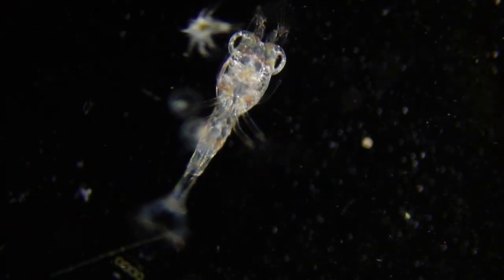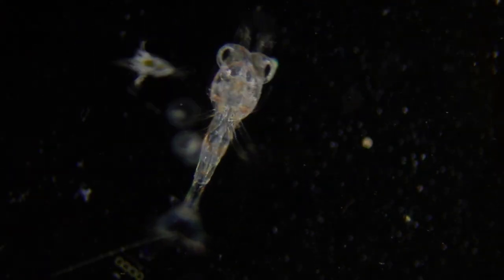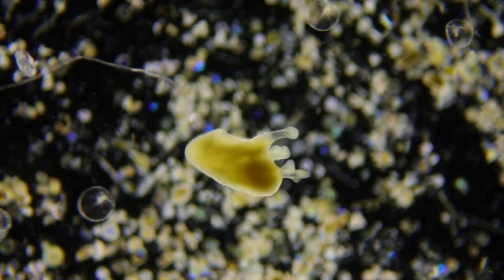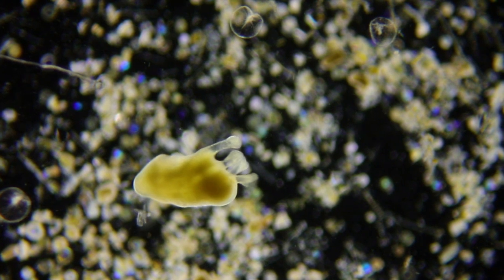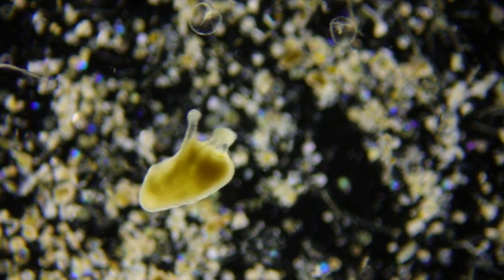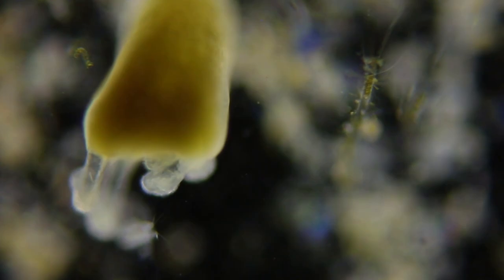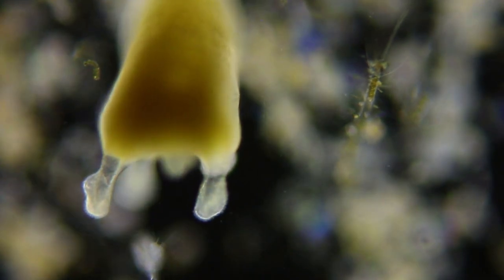Even a shrimp zoea. The guest star this week is the sea cucumber. It's an echinoderm, related to sea stars and sea urchins. Here is the pentacula larval stage. There are a cluster of feeding tentacles at one end.